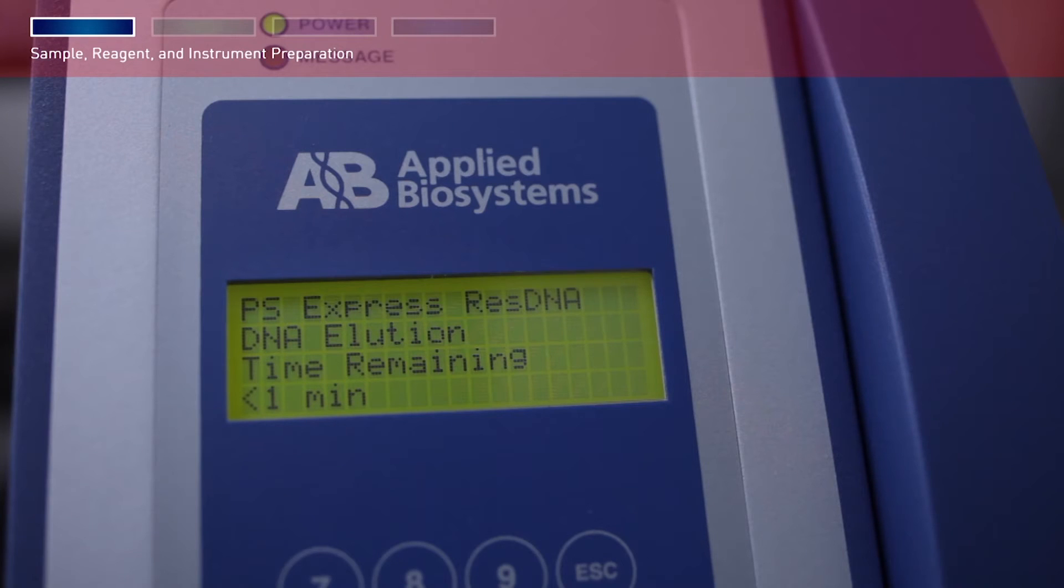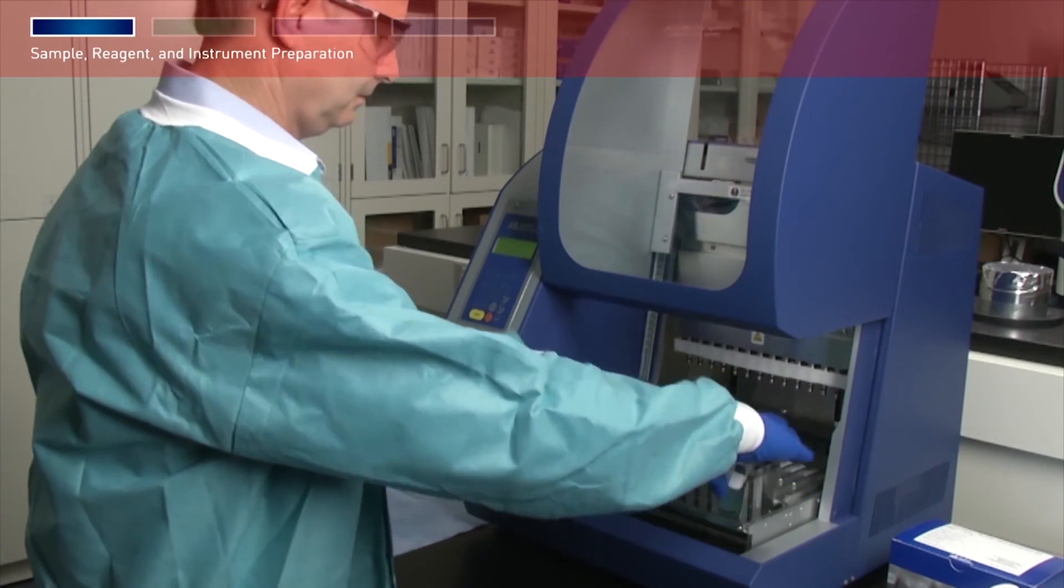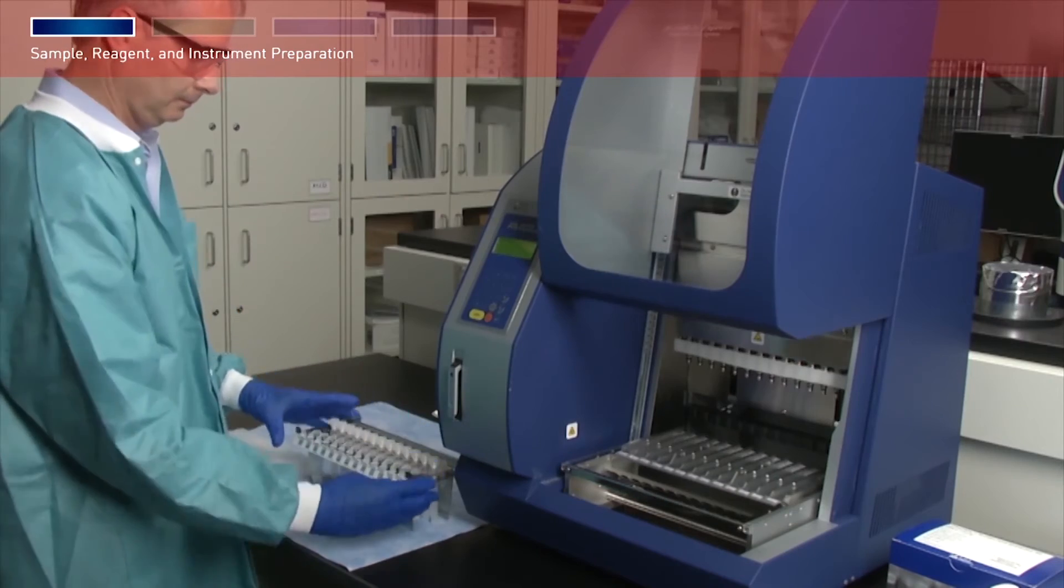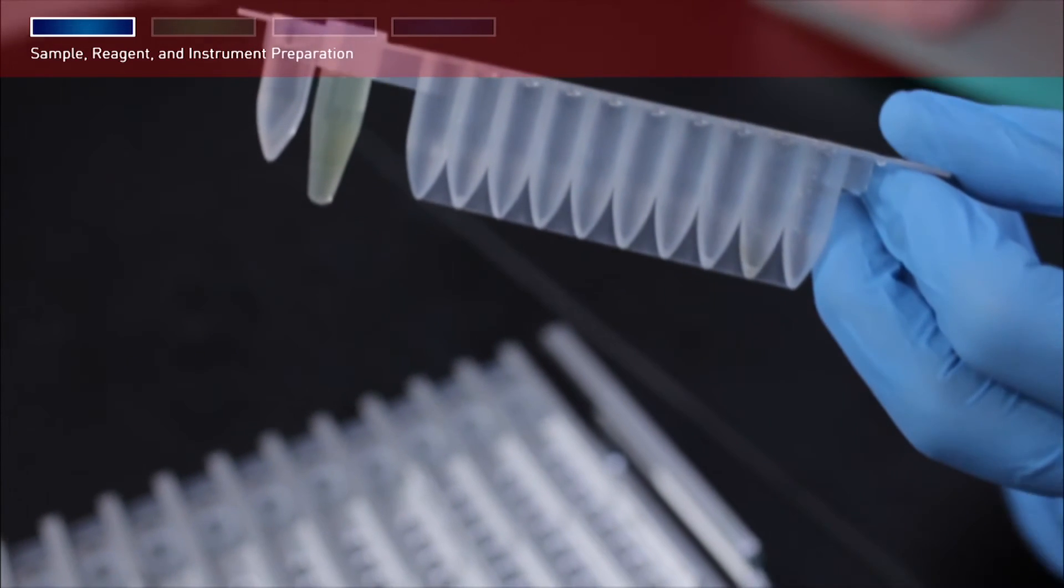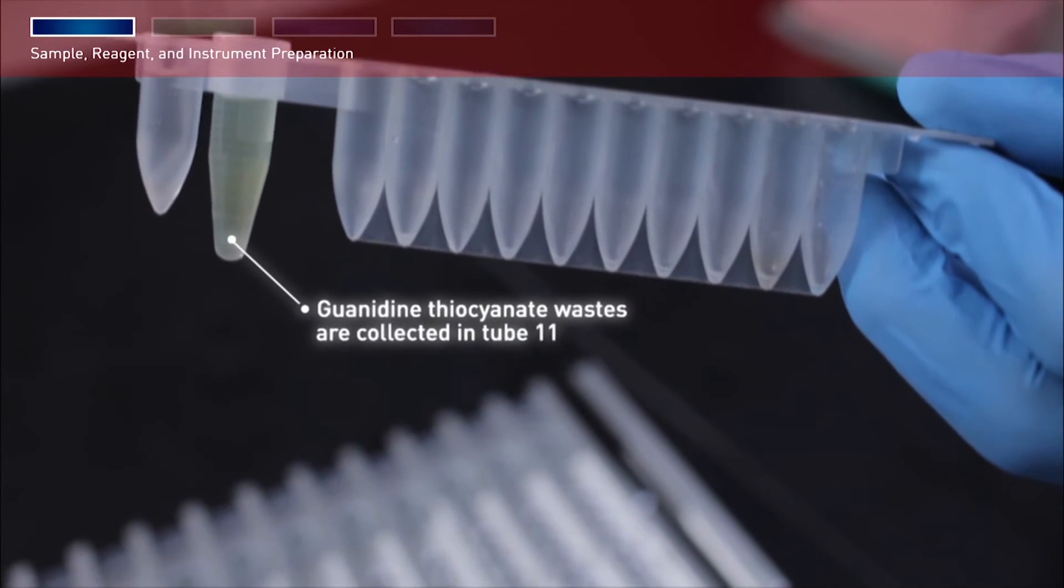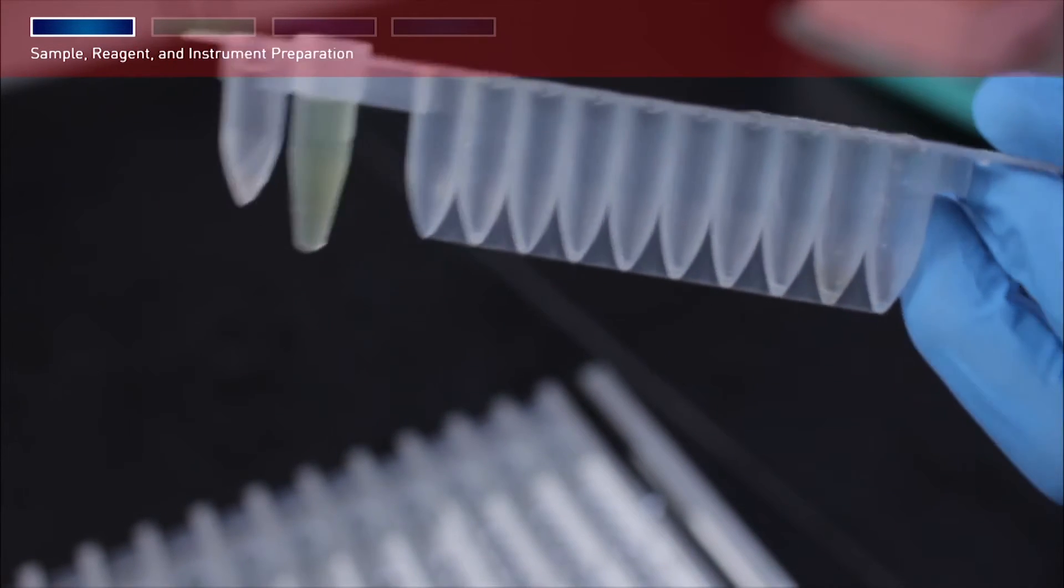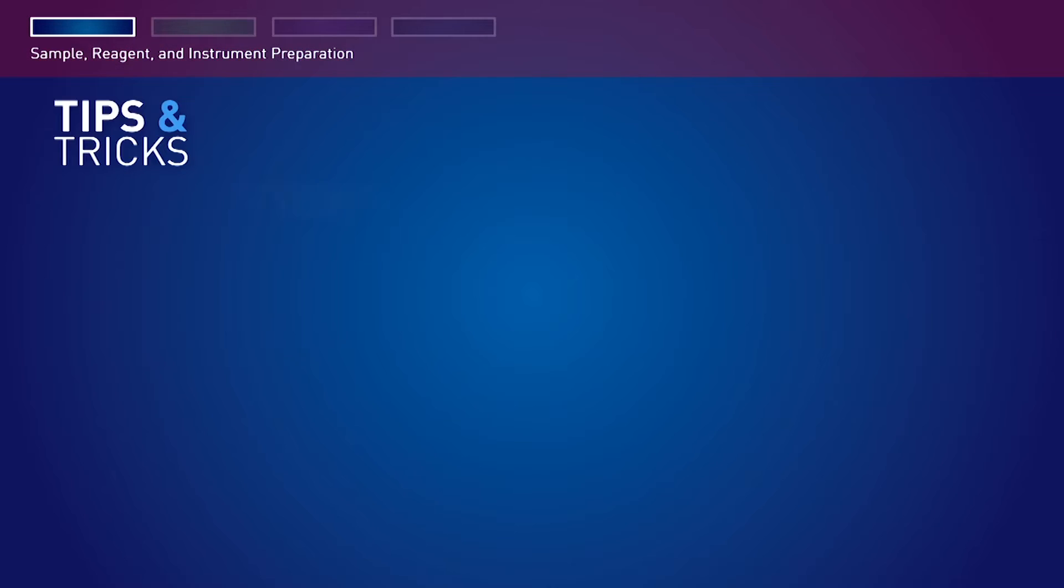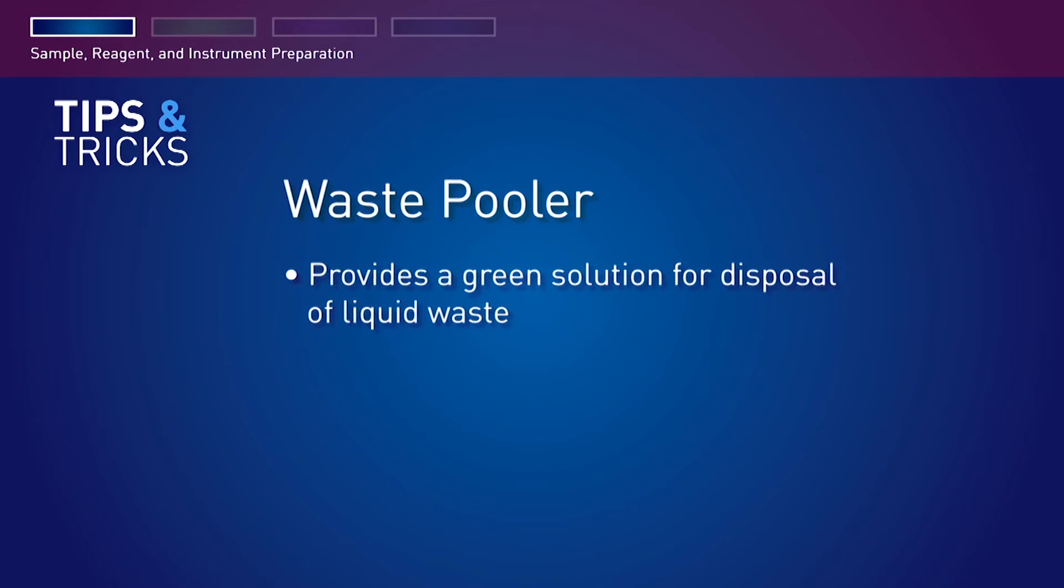At the end of the run, the instrument beeps briefly and the digital display shows additional options. Select an option, then open the instrument door. Remove and cap the elution tubes containing the purified nucleic acid. If you ran the waste pooler protocol, the guanidine thiocyanate wastes are collected in tube 11 and the alcohol-based wastes are collected in tube 12, leaving the rest of the cartridge empty and easy to dispose.